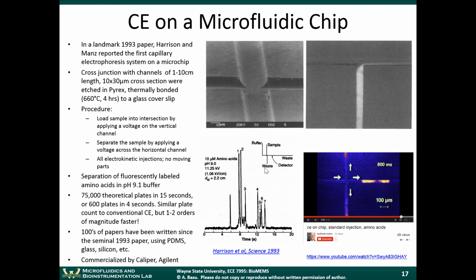In fact, I think Andreas Manz was one of the guys who coined the term lab on a chip or micro total analysis systems. So this field is relatively new. Relatively speaking, it's not that old. It's probably only 20 years old. There's been a lot of development since some of these early landmark papers.